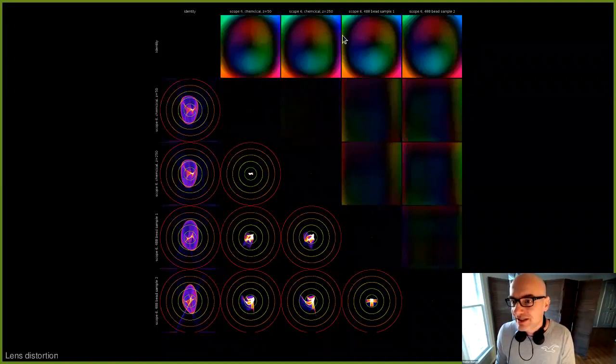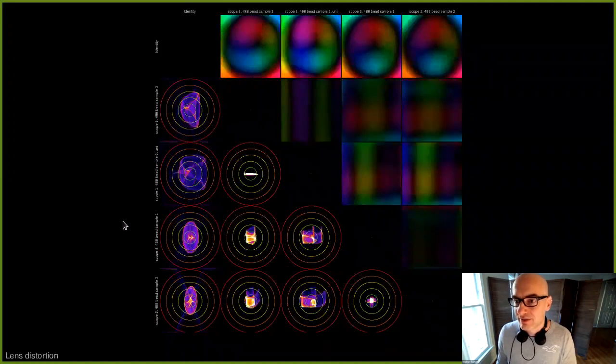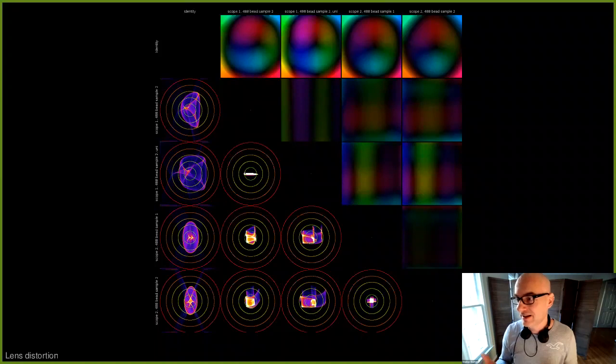Okay, so here we see that on a different microscope we have a very similar outcome, and now we can compare between different microscopes because obviously it's interesting. They're all the same manufacturer. They're all the same size system. Can I estimate the lens deformation on one microscope once and then use it forever? That would be wonderful because I wouldn't have to do it again. And it turns out this is not the case.